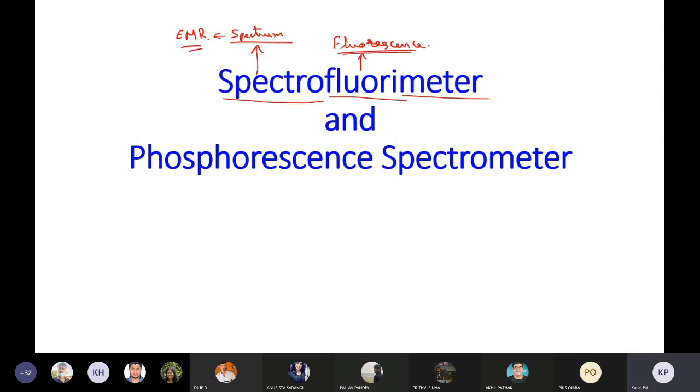What is fluorescence? Fluorescence is a phenomenon where some material can absorb light at a specific wavelength.